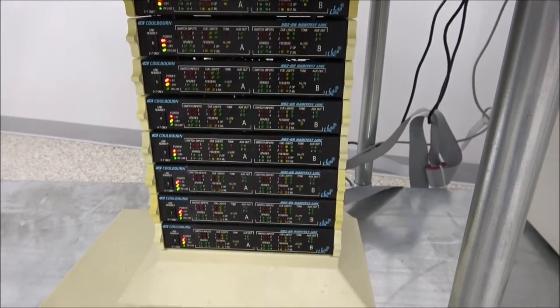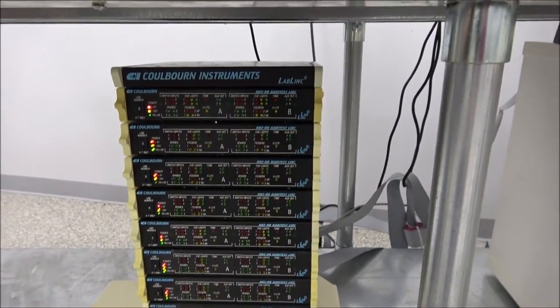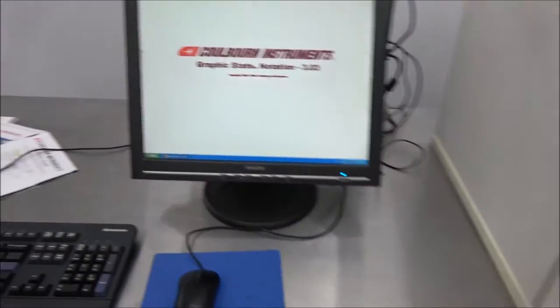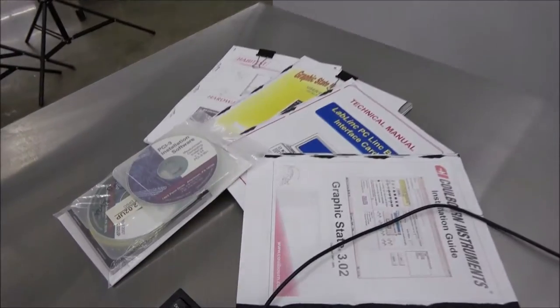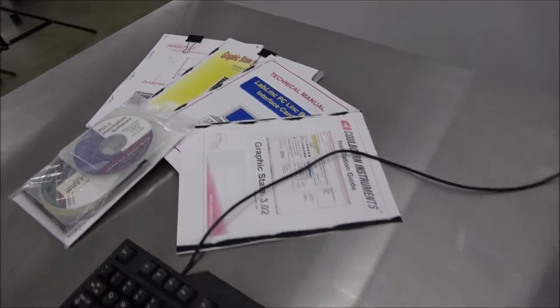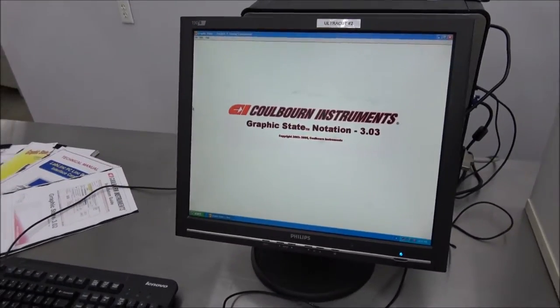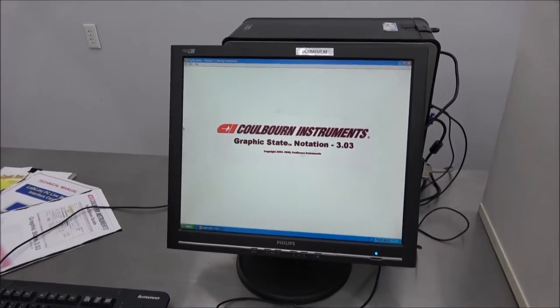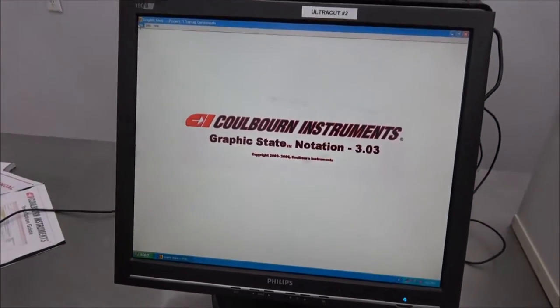Each module has plenty of inputs and outputs, so shouldn't have any problem there. And then over here you can see all the manuals and software disks there. I'm going to turn it over to Bart here—he's going to explain a little bit about what he's done to create a little program and show you how it works.